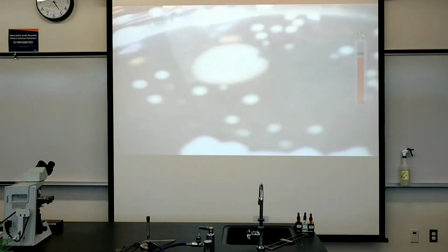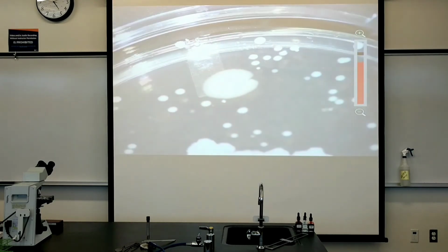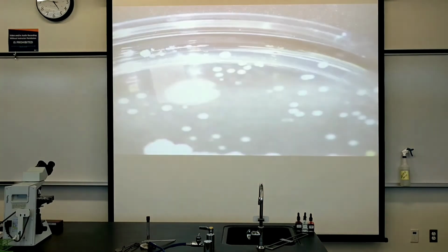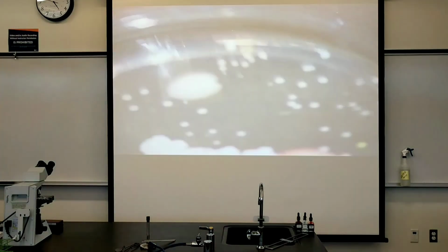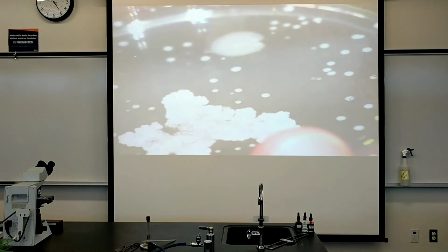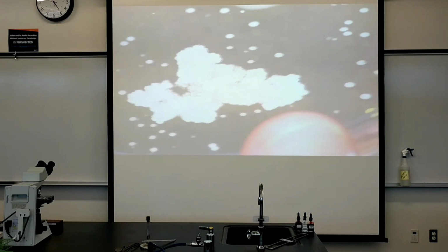Can we get that to focus? A little hard to tell. Okay. Well, this might be a fungus.